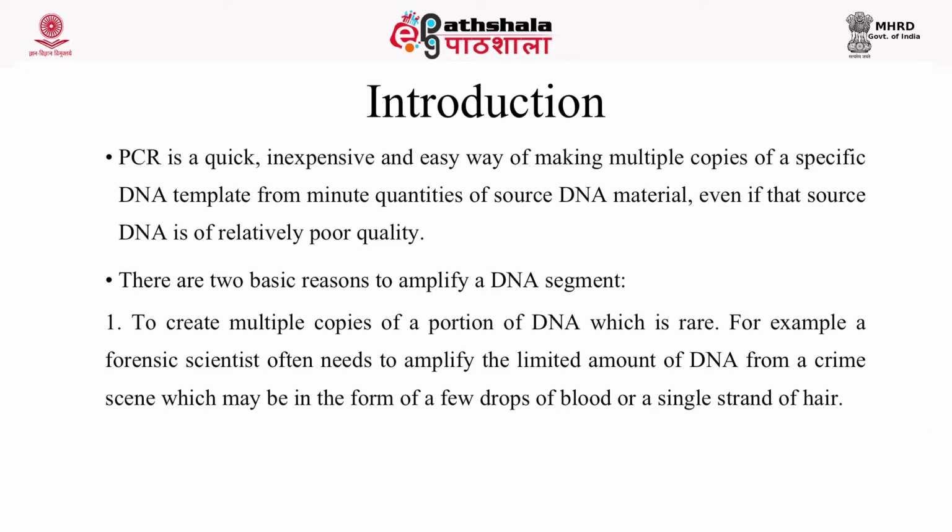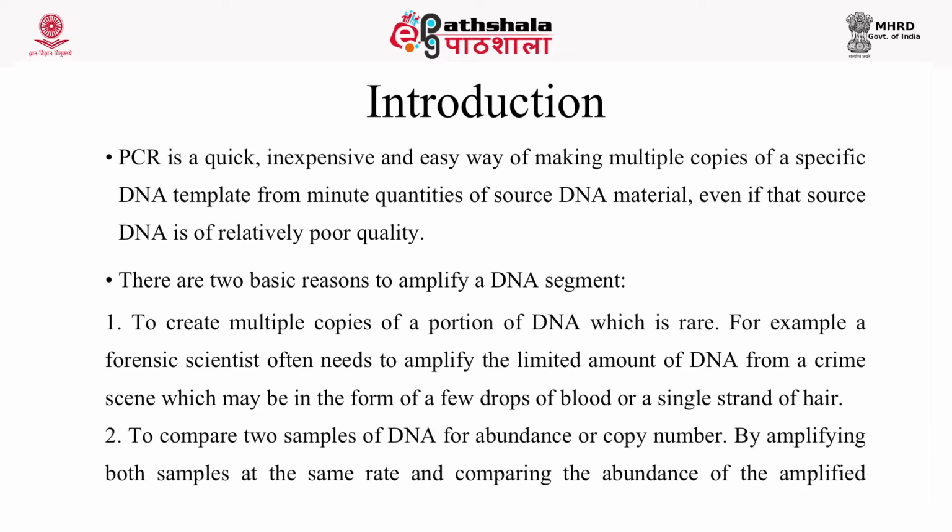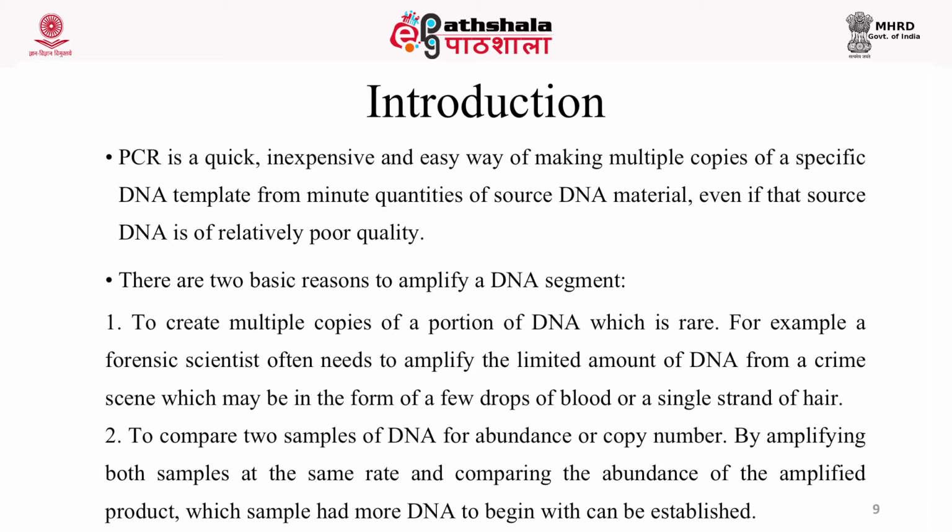Let's take an example of a forensic science scenario in which we have evidence as a single drop of blood or a single hair. In order to help in the criminal investigations, we need to amplify this small amount of DNA from a small hair or a drop of blood, and in this, PCR is a useful technique. The second reason is to compare 2 samples for abundance of DNA. Comparing two samples for abundance of DNA can help us understand which sample has more expression of this DNA.